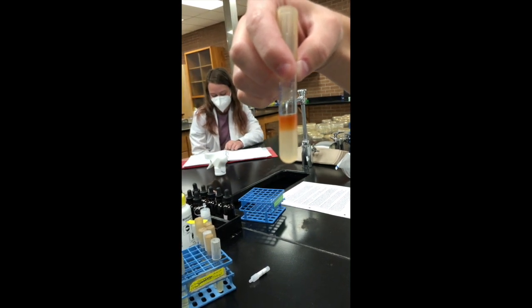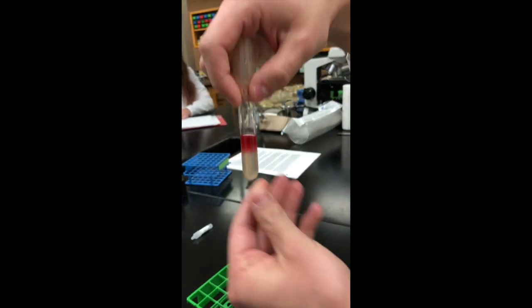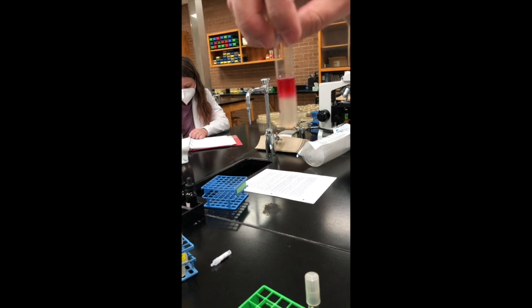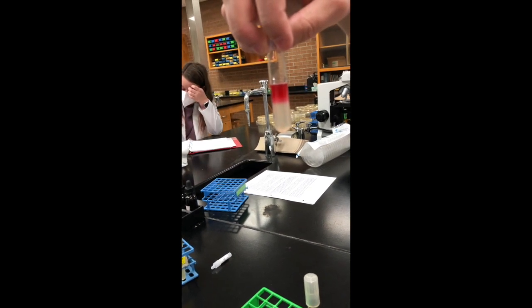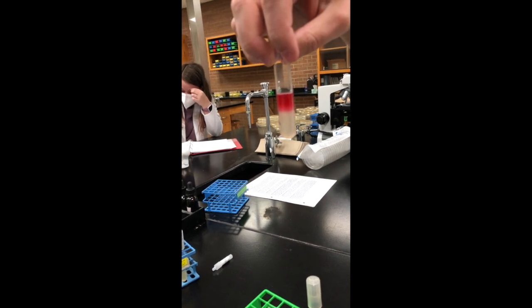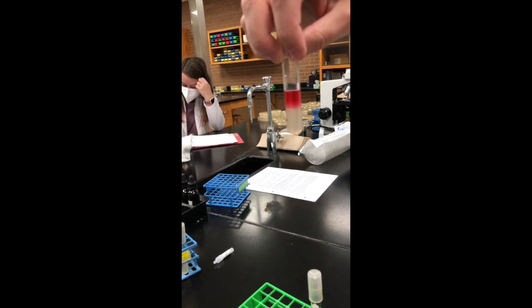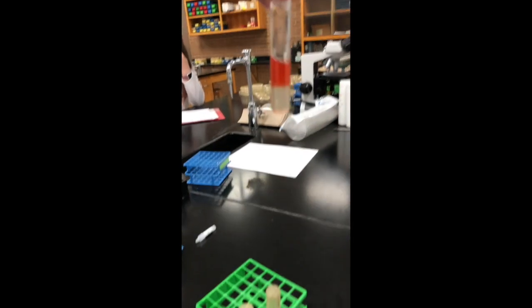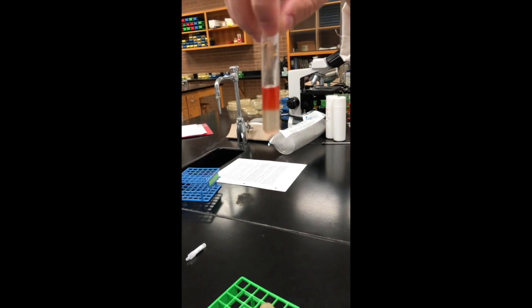Let's take a look at the E. coli tube. See how this is a nice red color? This shows me that the pH dropped enough to indicate that this organism can undergo mixed acid fermentation. Now let's check out your unknown. You be the decider. What do you think?